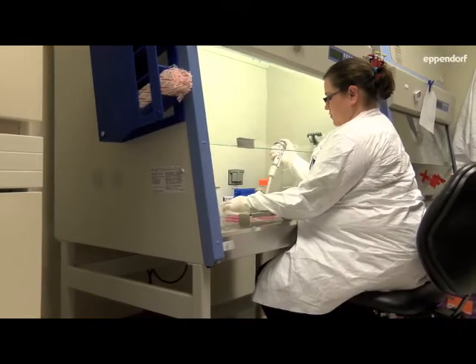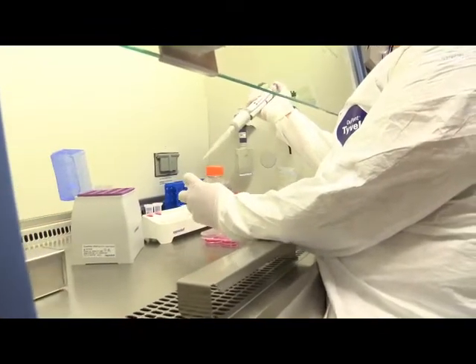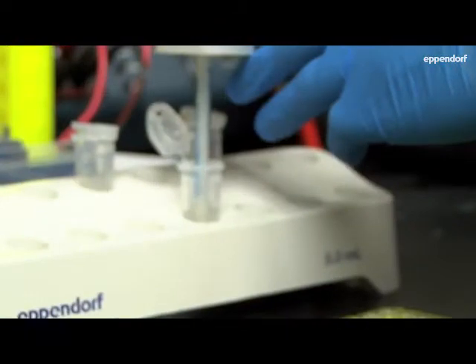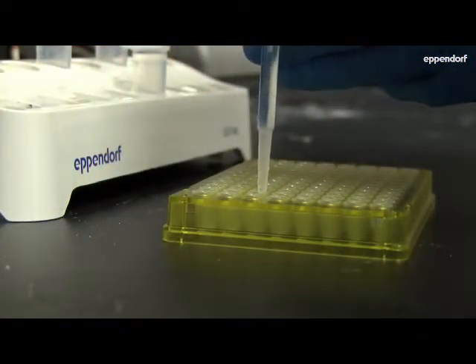Contamination is a big thing that I'm constantly paying attention to, so knowing that I have a product that's going to help reduce that risk makes repeats of experiments less likely. It improves our process because we are able to make those larger size volumes without necessarily needing to pipette into multiple tubes, so we know that our master mix is consistent across multiple plates of samples.